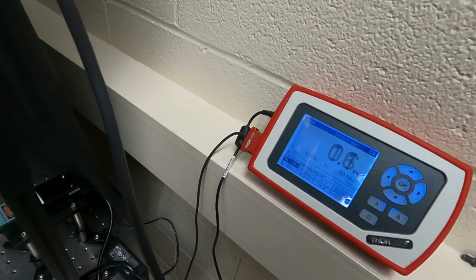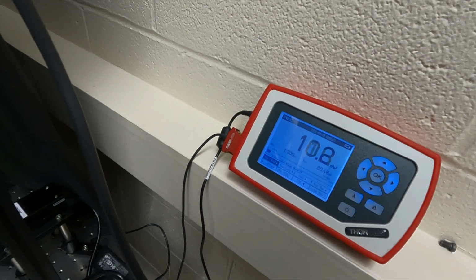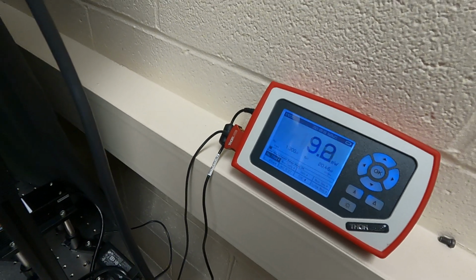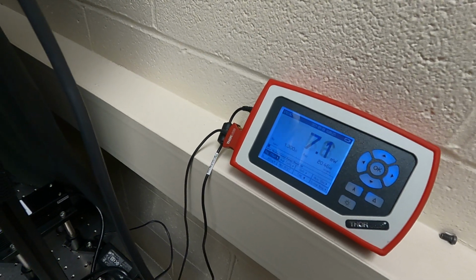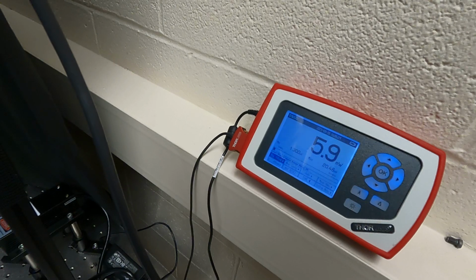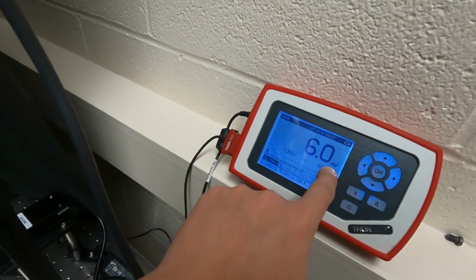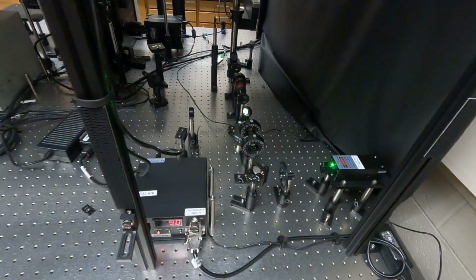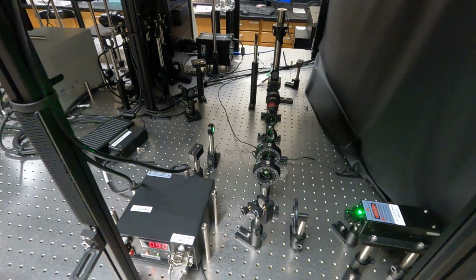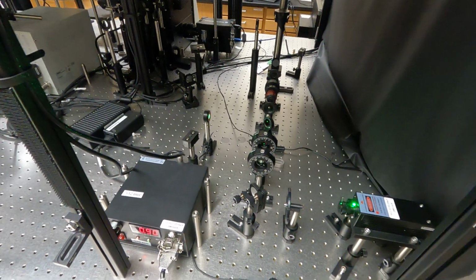Typically for our experiment, we want to set the laser power to a value between 5 milliwatt and 10 milliwatt. For instance, this time I am adjusting the laser power to roughly 6 milliwatt. The unit is milliwatt, and 6 is a good number. We typically use this much intensity for a single molecule measurement.